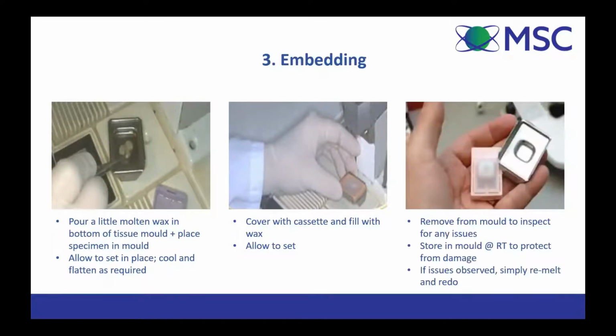And then finally, you remove your block from its mold to inspect for any issues, and you can store it in the mold at room temperature to protect it from getting chipped or damaged. And this is a great phase because you can actually observe if your embedding went really well or not.